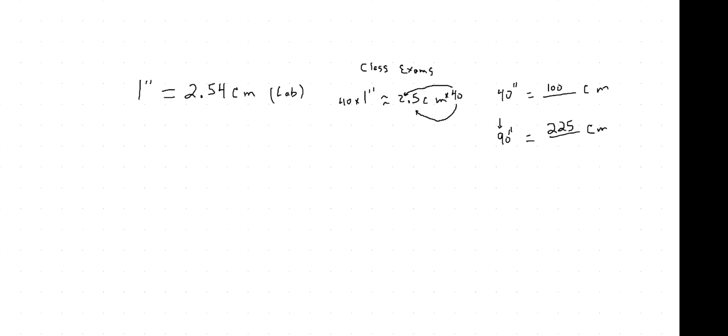Okay, now we're going to measure things like, in lab 1, we want to measure mass. Okay, mass is not the same as weight. It's not the same as the weight of an object. Keep that in mind. We'll learn about this later. Weight is actually a force, the force due to gravity.